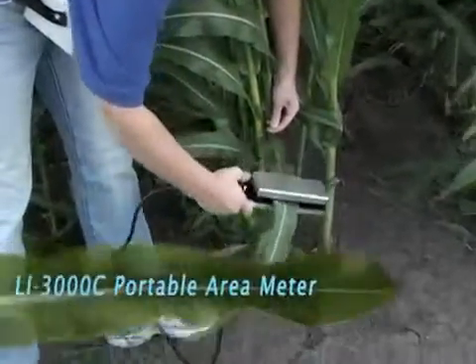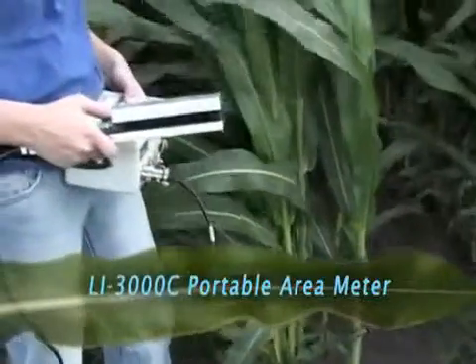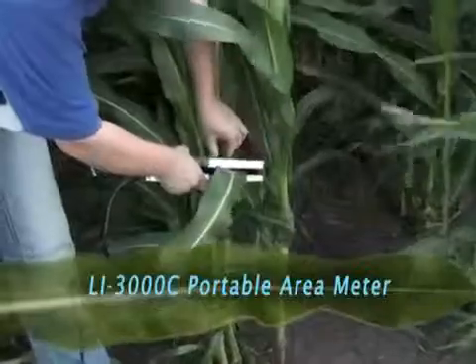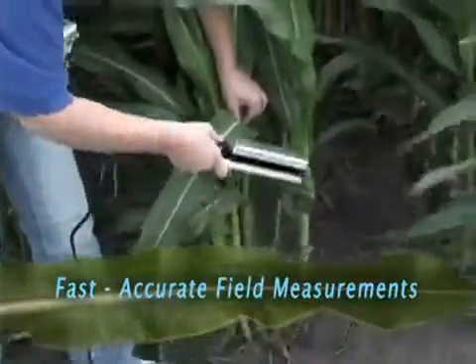The LI-3000C is a scientifically proven field-portable leaf area meter used for non-destructive measurements. Along with leaf area, the LI-3000C also measures leaf length, average width, and maximum width.